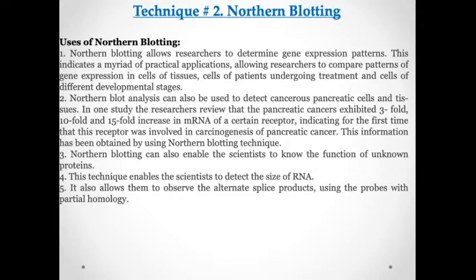So what are the applications of Northern blotting? It allows researchers to check particular gene expression patterns, with a wide variety of practical applications, such as checking gene expression in cell tissues, in patients undergoing treatment, or in cells at different developmental stages. It helps to detect the size of the RNA, to know the function of unknown proteins. It also helps to observe splice products, alternate splice products, using probes of partial homology.